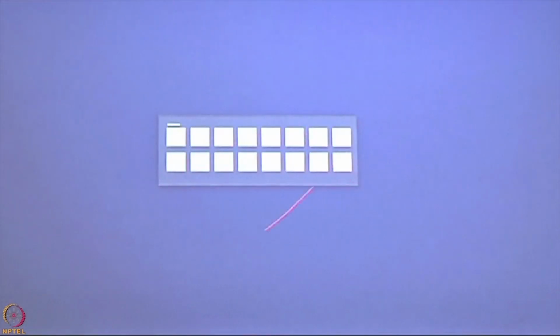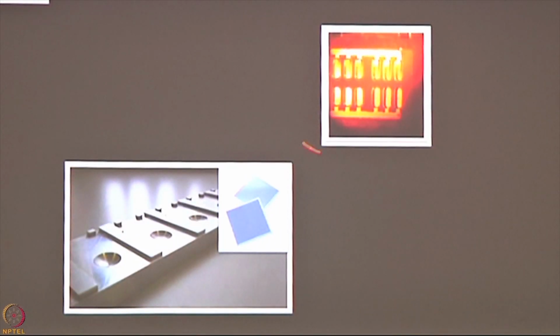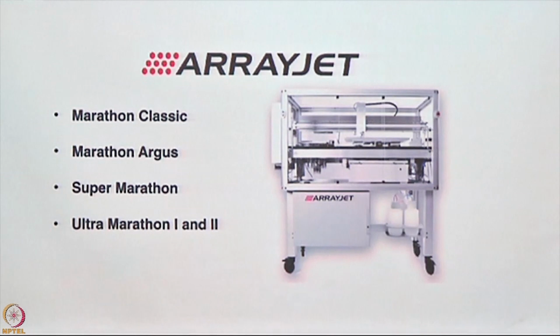So you have a slide, you have a multiplex slide, you can even go as big as a plate, so each ELISA can happen on a plate. You've got chips, if anybody is doing microfluidics work or any of the lateral flow techniques, they can all be transferred.